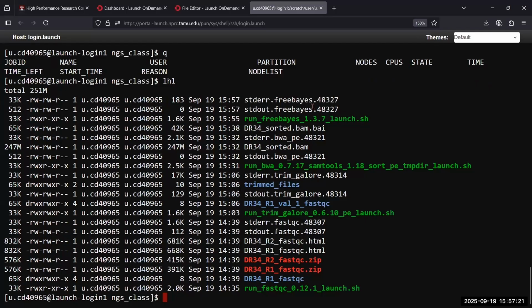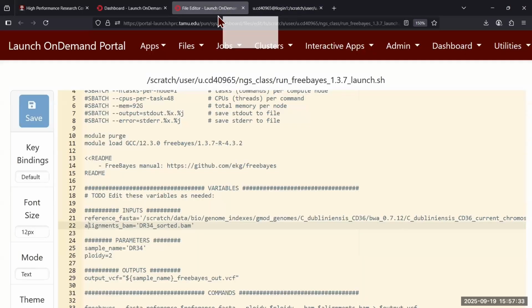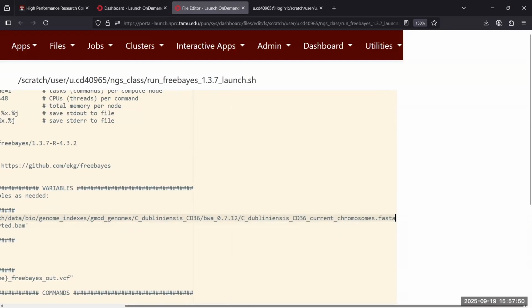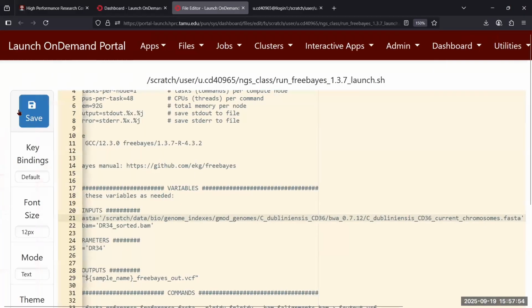Nope, something's wrong. I did something wrong, maybe. Uh-oh. I have a quote somewhere. It's missing, maybe. Maybe the end here. Yep. Yeah, I had a double quote there. I missed a quote, so I have to resubmit it.